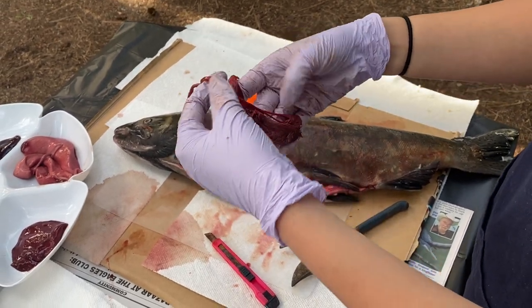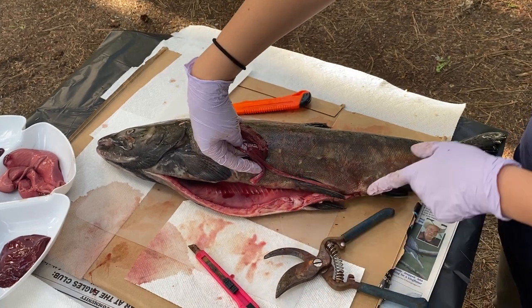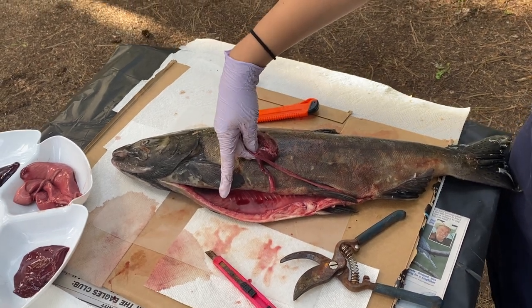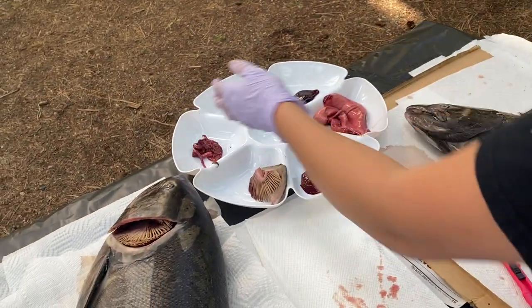And then after the pyloric ceca, here you see that we have an intestine, and the intestine runs the whole length of the body. Any waste that is produced is going to be expelled through the vent as fish poop. And it's super tiny though, because he has not eaten in a long time.